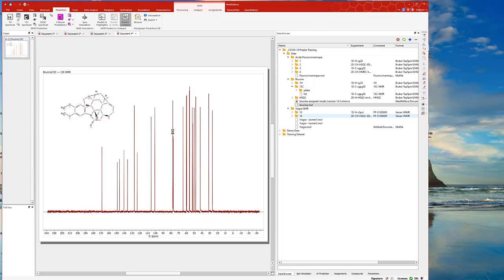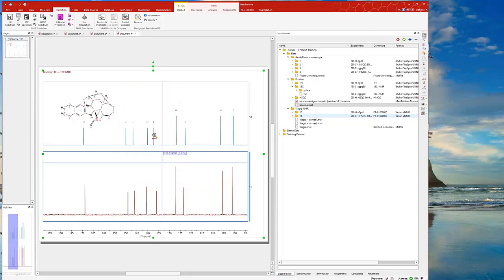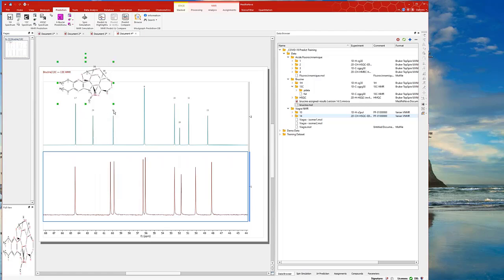I hope you are following with me. Yeah, right. So we're going to get the predicted spectrum. If we zoom in, you can see what the prediction is. Yeah, there's some differences around there. And if I move to the other regions, especially around here, we do have some quite significant differences, especially like here. Move the structure away. You can see 29, 26.